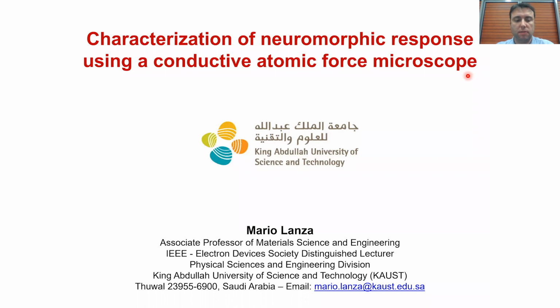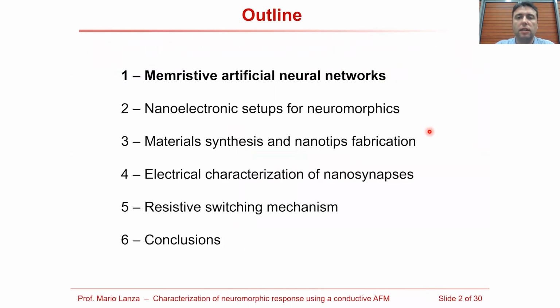Hello, everyone. My name is Mario Lanza. I am an associate professor at the King Abdullah University of Science and Technology. I would like to thank the organizers of the conference for inviting me to give this presentation. The title of my talk today is Characterization of Neuromorphic Response using a Conductive Atomic Force Microscope. This is the outline that I will follow. First, I would like to start by making a brief introduction about memristive artificial neural networks.